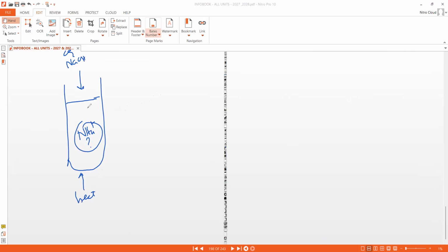If ammonium is present here, it will release ammonia gas. Now we'll see bubbles, fizz. So then there must be ammonia. To confirm that it's ammonia, the gas must be tested with damp red litmus, which it will turn blue. Okay, so that's the test for ammonium ion.